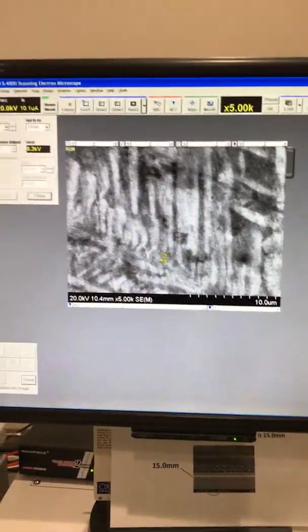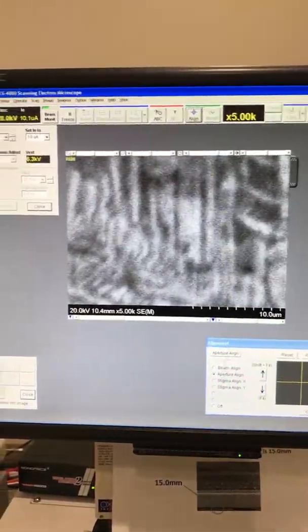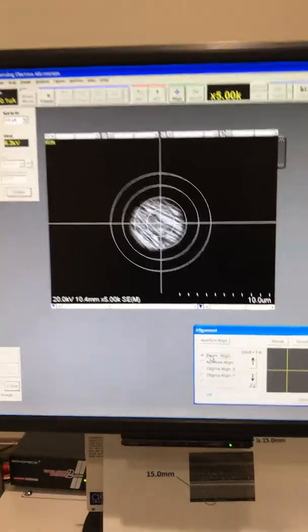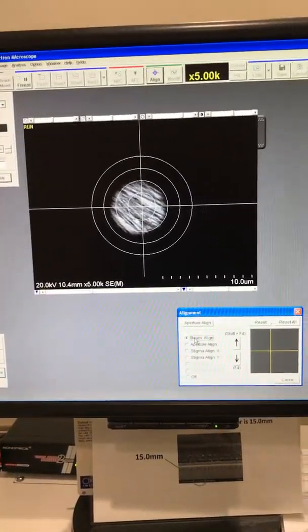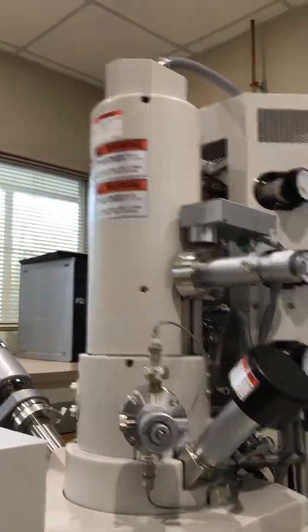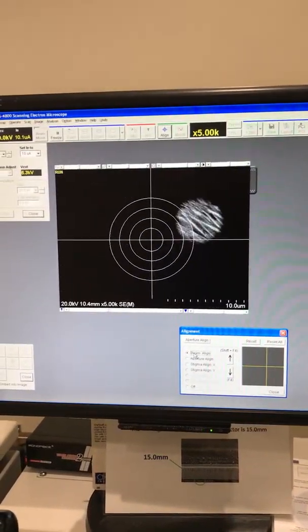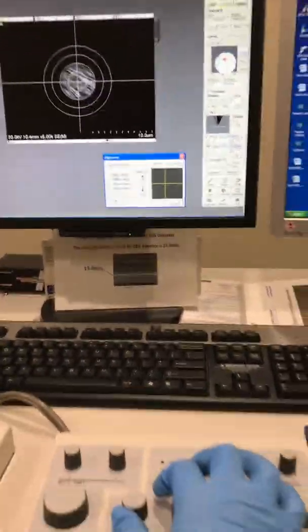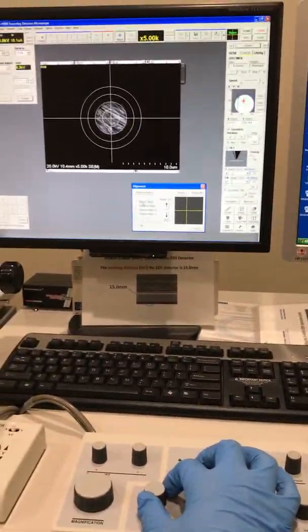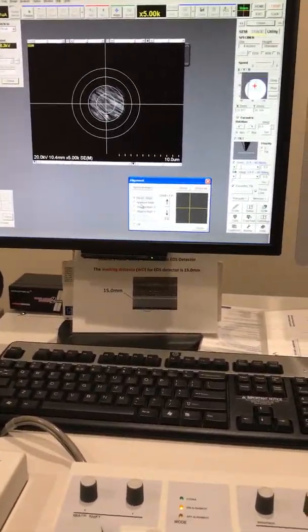Try to be at 5k and then push your alignment button. First thing, as we talked about before, make sure the beam passes through exactly the center of your column. Using these two X and Y controls, you can bring it to exactly the middle.